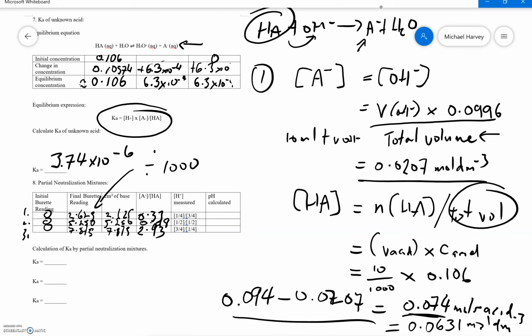Okay, now I'm also going to use Nannerel's numbers here. So she got 4.16 for the pH of that solution, 4.60 for that solution, and 4.88 for those solutions. Okay, so now with those numbers, we can determine the associated KAs. That's the next step.